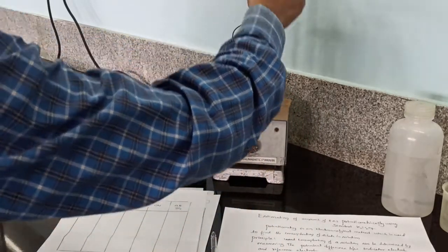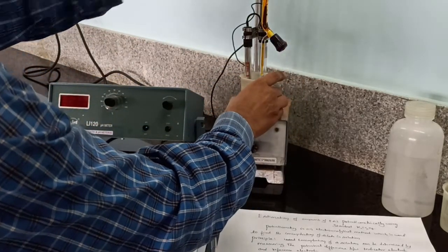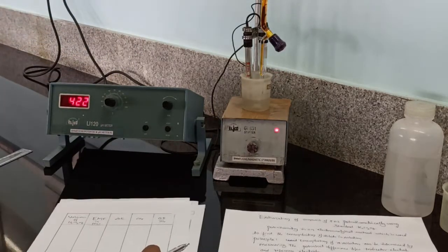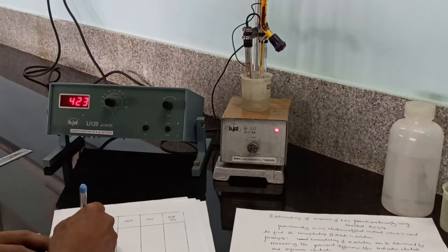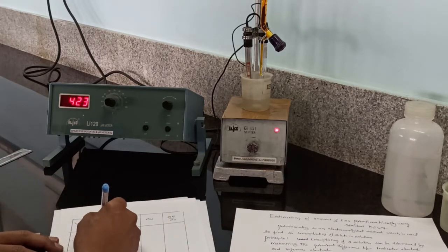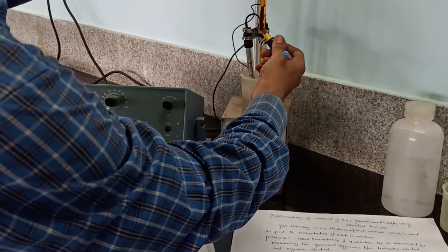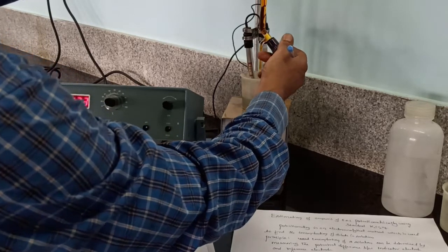Fill the burette with potassium dichromate solution. Then switch on the instruments. Before addition of any amount of potassium dichromate solution, note down EMF. At 0, the EMF is 423 millivolts. In each step, we have to add an increment of 0.5 ml of potassium dichromate.